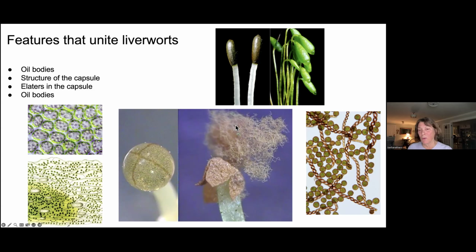It puts forth a mass that looks like cotton candy, which is a mixture. Looking microscopically on the right, there are spores, and then these long structures with coils of thickenings called elaters, and those act like springs and propel the spores out into the environment. So as different as they all look, all liverworts have those things.